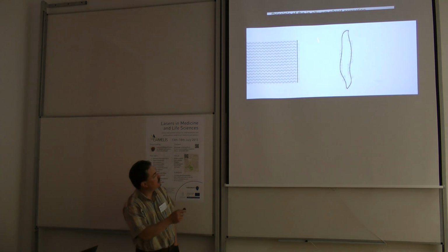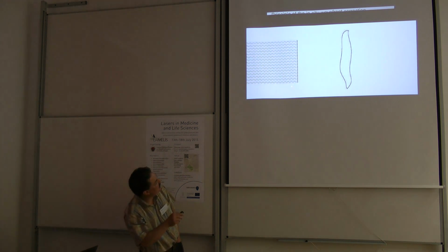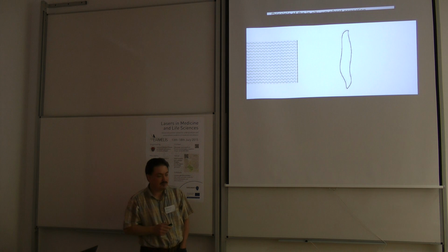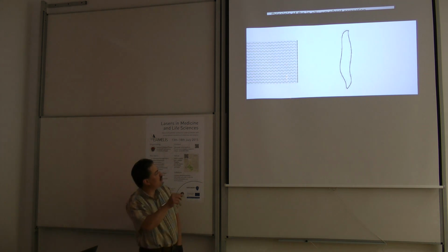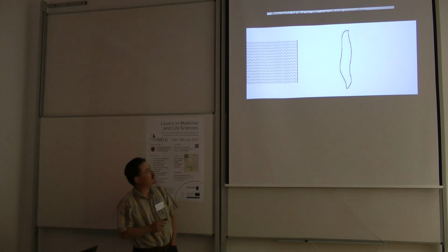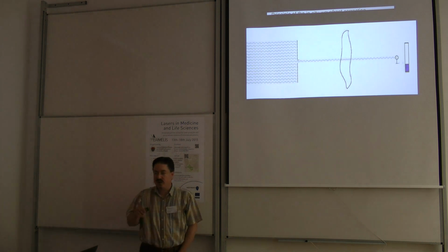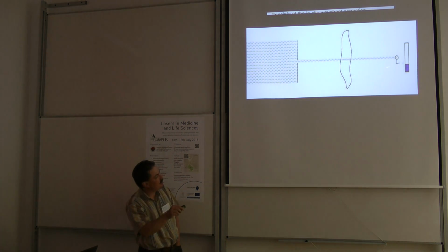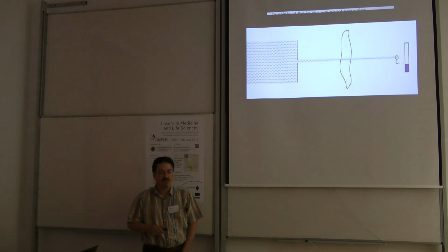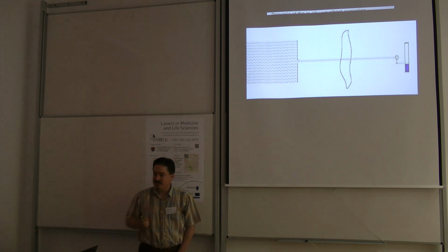We can take the semaphore here, and you can barely see, but there are these windows that I can independently turn on or off. The first thing, I block the beam, and I will only allow one of them to go through the system, ideally one in the middle. So I open the door, one goes through the system, and then I need to define the position where I want the light to be focused, and I have to place there some kind of intensity detector. It can be, for example, a fluorescent particle. That's the best one if you want to do it in tissues.